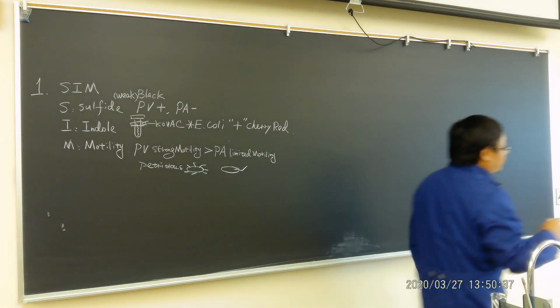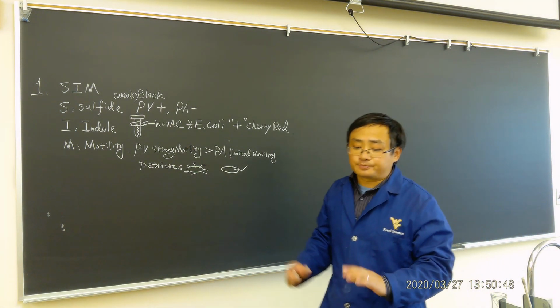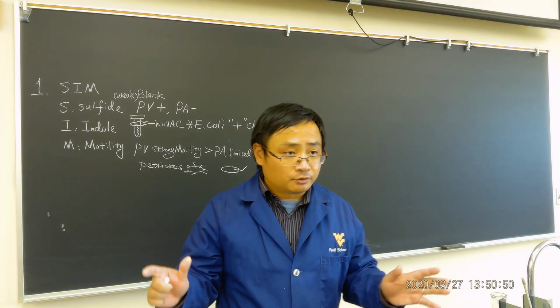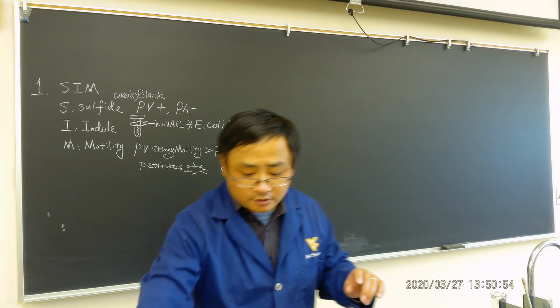Because for E. coli, there's a lot of tests we didn't do in the lab, for example the 3-tube fermentation test. Like next week we will use petrifilm to see the colony. We use spread plating, whatever. It takes a lot of time, including the entero tube.